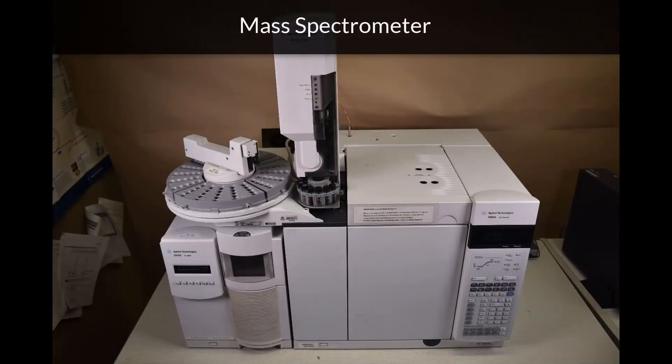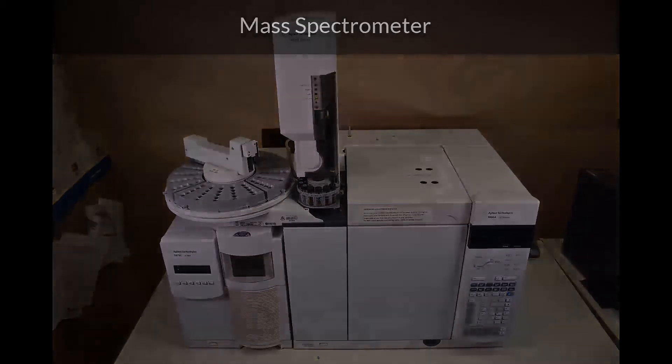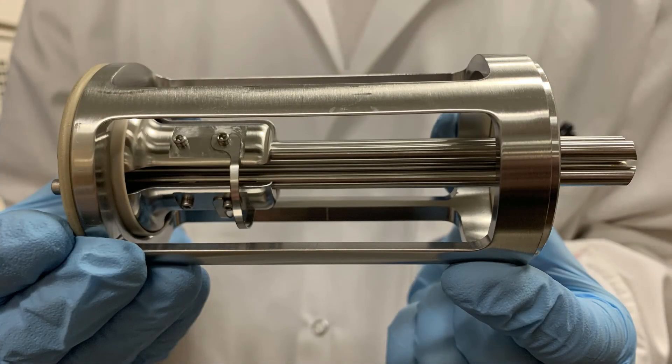This instrument uses a mass spectrometer as a detector. The mass analyzer is a quadrupole. It consists of four rods that have alternating voltages applied to them. Only selected mass-to-charge values will have a stable path through the rods and then are counted based on their relative abundance.